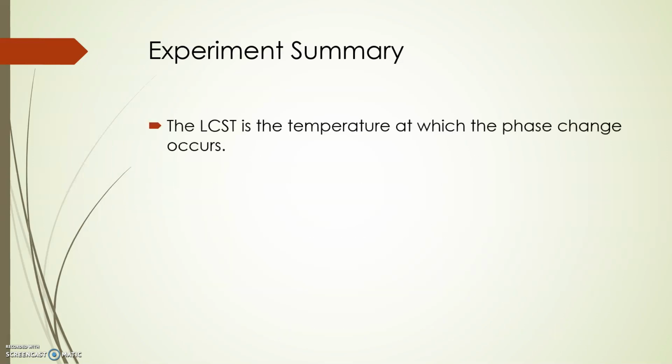So delta LCST is the difference in the transition temperature when no salt is present and the transition temperature at each specific salt concentration. You will be graphing all of the salts and all of the different delta LCST from the entire class on one graph. Make sure when graphing, the scale is appropriate, axes are labeled, there is a graph title, and if necessary, a legend.